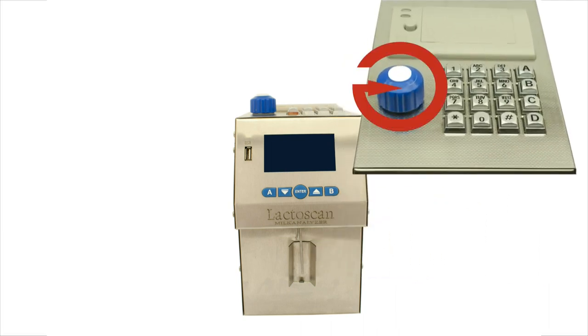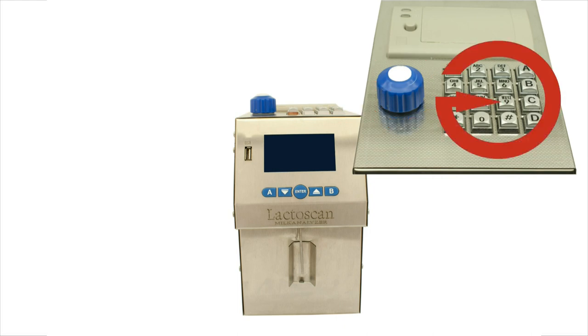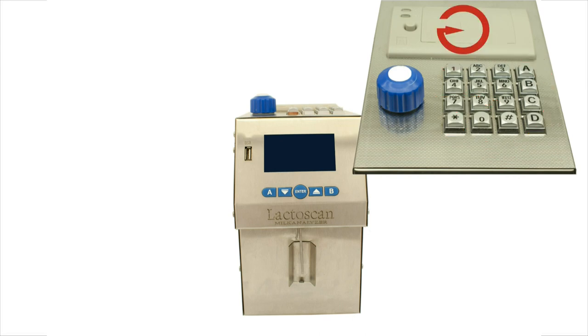Optionally, you may order this unit with inflow pH measurement system for determination of acidity of the milk. You may also order this unit with embedded keypad and printer.